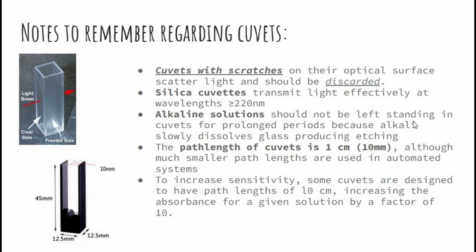Alkaline solution should not be left standing in cuvettes for prolonged periods of time because alkali slowly dissolves glass and produces etching. The path length of cuvettes, yung distance po, ito yung length niya, is approximately 1 cm or 10 mm. Kindly take note of that.